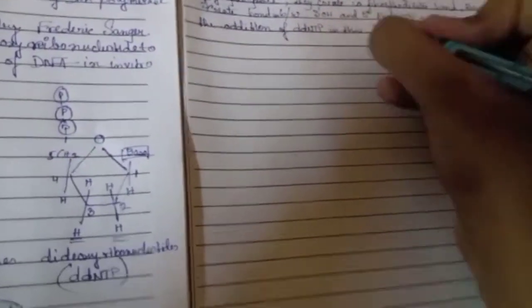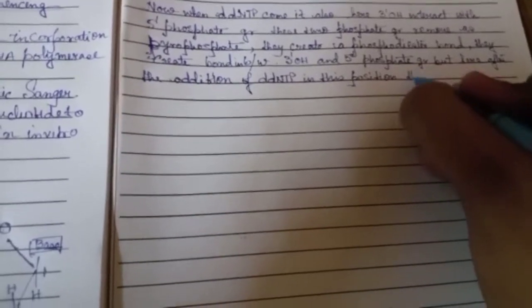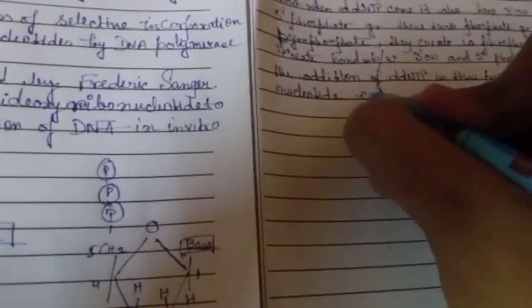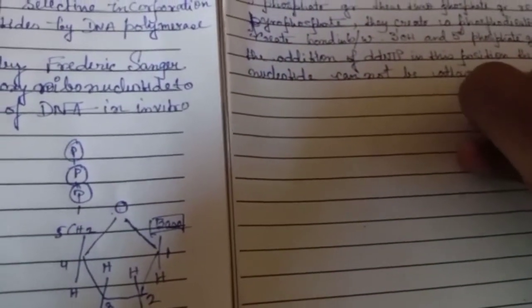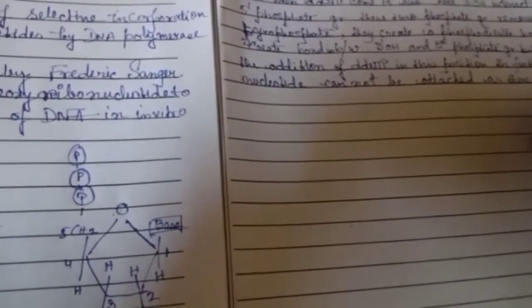If we compare with NTP or dNTP, they have an OH group in the number 3 position, but in ddNTP there is no OH group or functional group which is required for the DNA polymerase reaction or DNA polymerization.